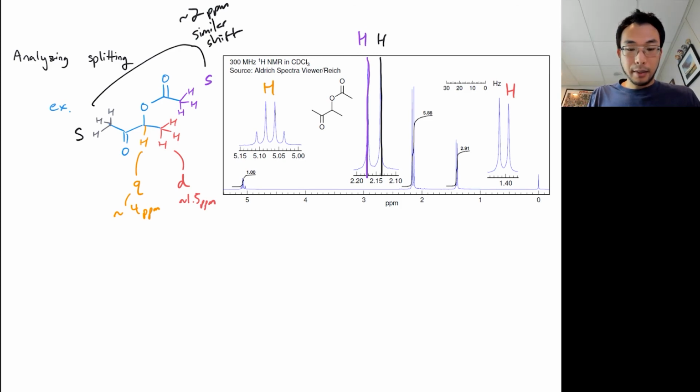And we can see that my guess of chemical shift for the quartet actually was a little bit too conservative. I could have shifted even more. So I should have taken into account the fact that I have the shift of just being next to the oxygen in addition to more of a shift from being next to the magnetic anisotropy.